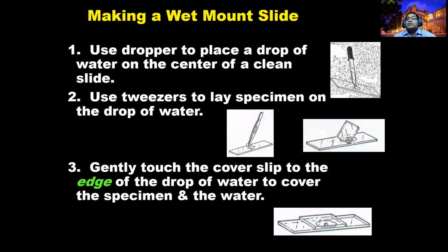Think of how IT people put a template, a screen protector, over a mobile phone. How are they sticking it, right? First, they clean it, then they put some liquid, place it on one side, and continuously press it to remove the air without trapping air bubbles, then fully cover the mobile phone. The same principle you should use to put the cover slide over the specimen and over the slide without trapping a single air bubble.